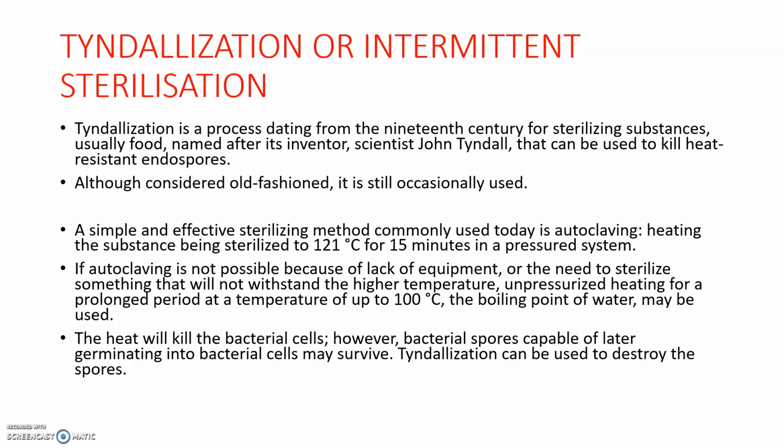If autoclaving is not possible because of a lack of equipment, or the need to sterilize something that will not withstand the higher temperature, unpressurized heating for a prolonged period at a temperature up to 100 degrees Celsius, the boiling point of water, may be used for sterilization.